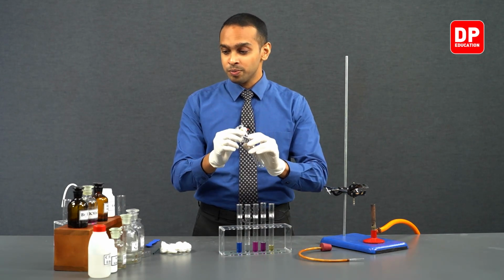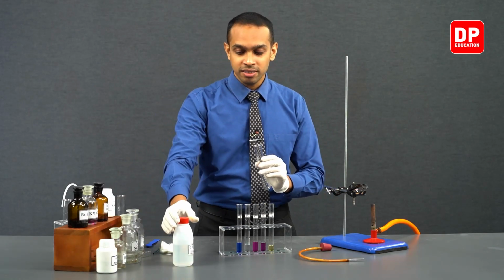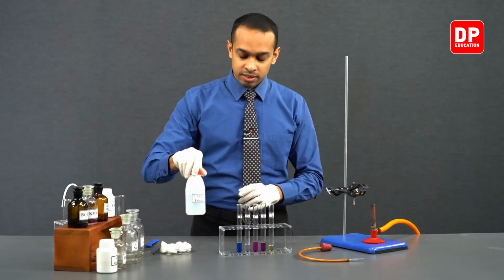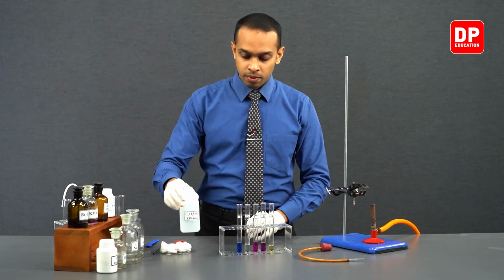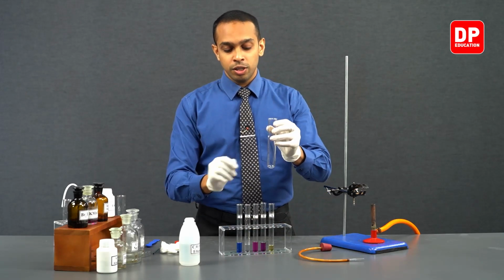So now let's take our ethanol that we have here, and we can add a small amount of ethanol into our boiling tube.